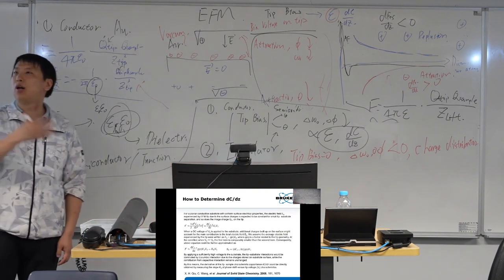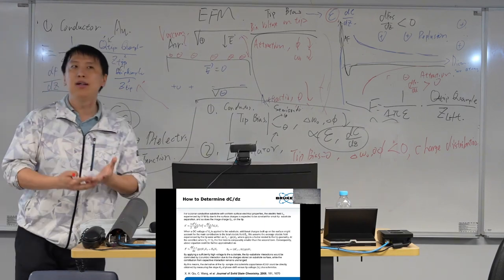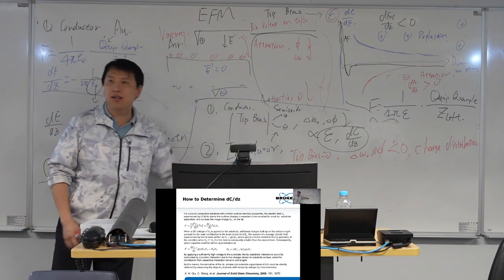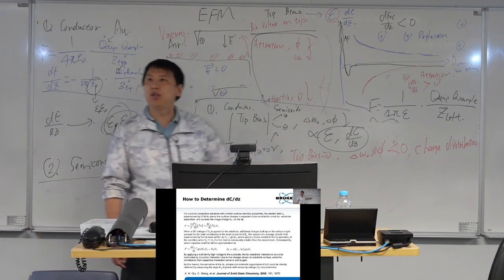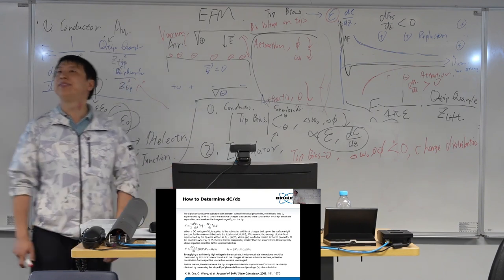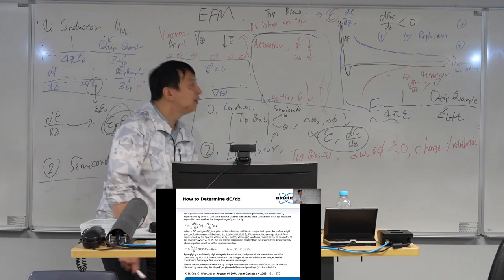Let's go back to our beginning example. We have carbon inside the rubber. That's the tire. You apply a positive or negative bias on the tip, and then on the carbon, you will get a negative shift of the resonance frequency. On the rubber, nothing. Right? That's the whole story of the EFM.